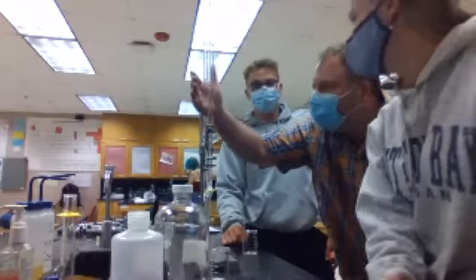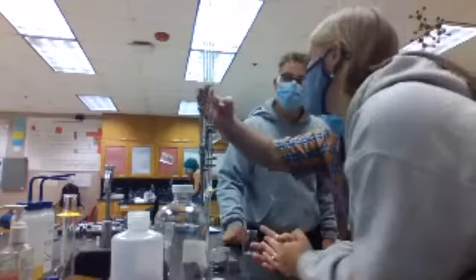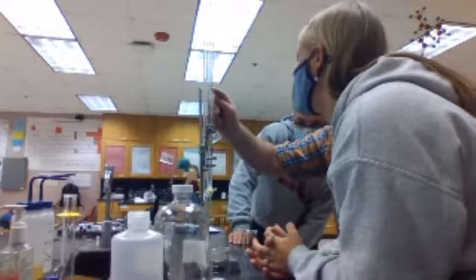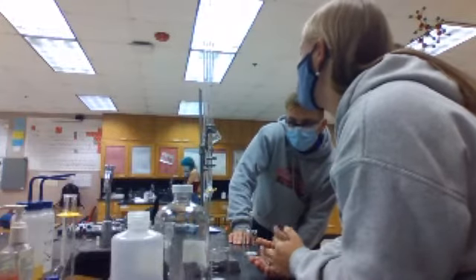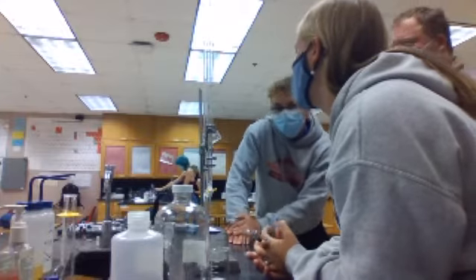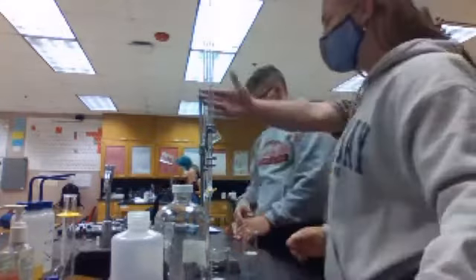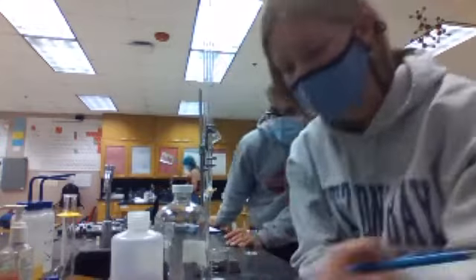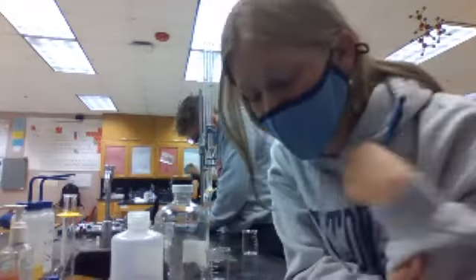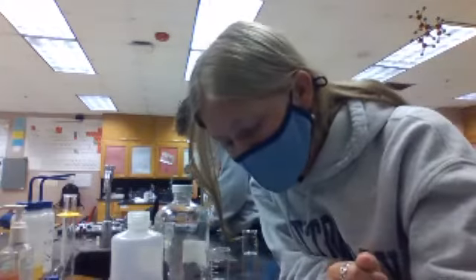Same one? Nice. All right, so we have 28 and 28.4. It's just above. I'm going to say 28.4. 39 or 40, right? You see how it's just above it? Yeah, okay, so 28.40. Okay, so for the initial volume of the base, it's 28.40.